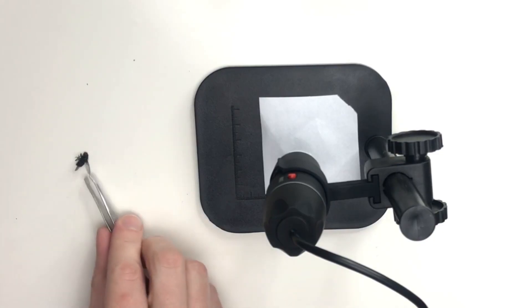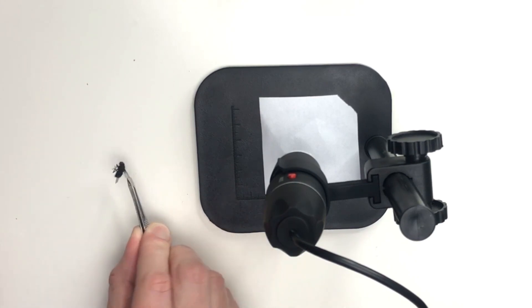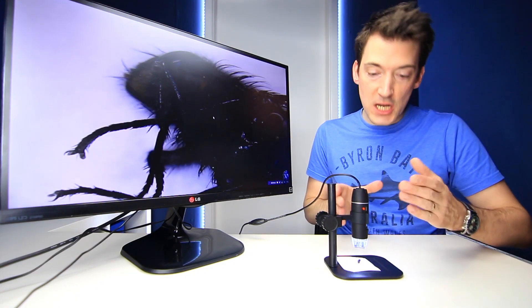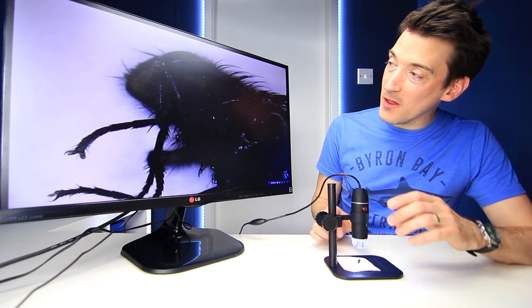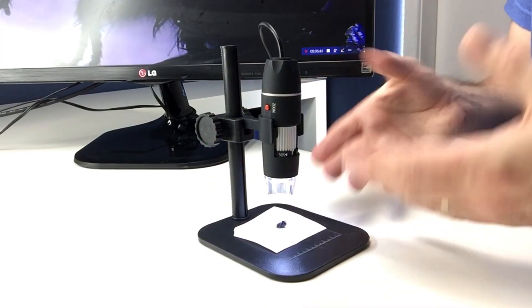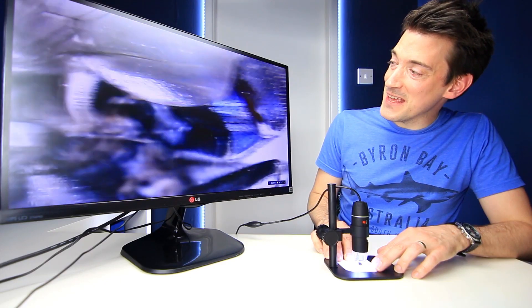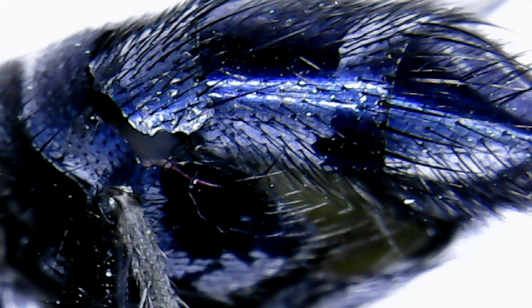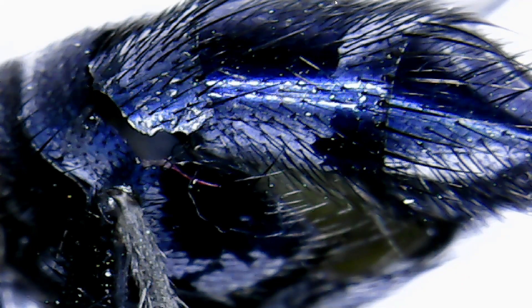The next item is a blue bottle — for those of you who don't know, it's a blue bottle fly, which is not poisonous or anything like that, but they are nasty little things because they land on pretty much everything and then they land on your food. I'm looking at it — I think that's his head — look at that, and that is quite a low magnification as well. I'm not even fully zoomed in, and you can see it's quite far away from the actual insect. That's why it's called a blue bottle — because it has a lot of blue in its abdomen — and it is just fascinating.